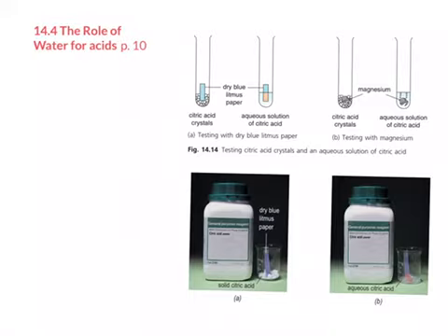Another experiment that shows the acid property is with magnesium. When we put the magnesium into the dry citric acid, it shows no observable change. However, if we dissolve the citric acid in some water, then gas bubbles will be given out.